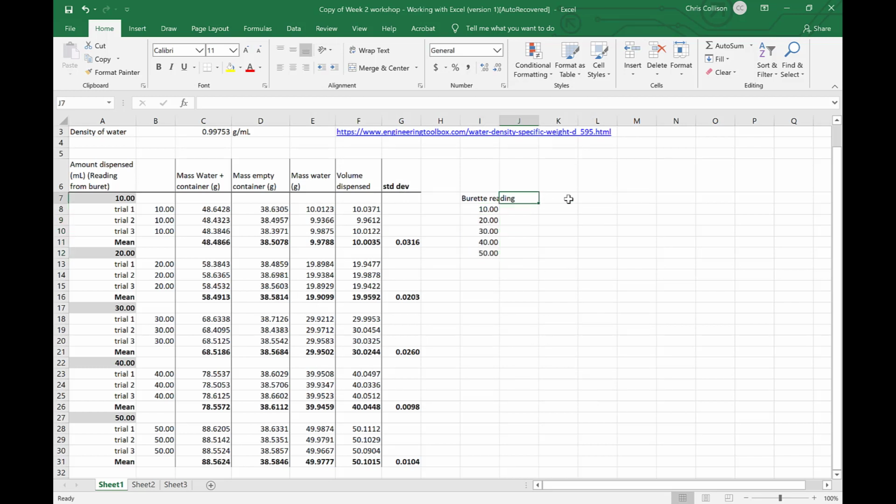I'm going to title this heading as the volume delivered. We might also call this the actual volume delivered. So we can choose anything we want as long as it conveys the appropriate information.